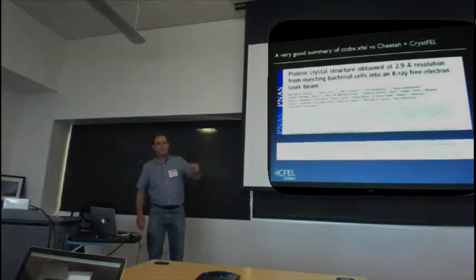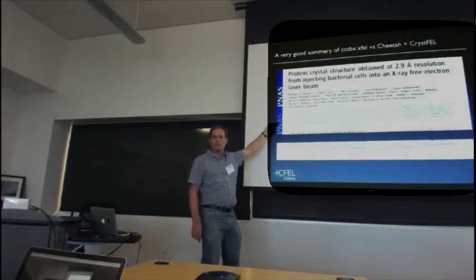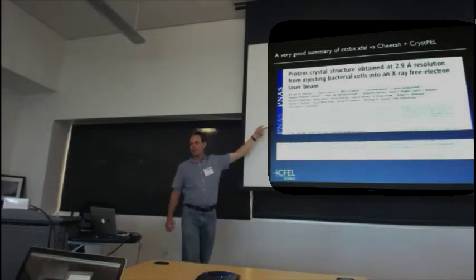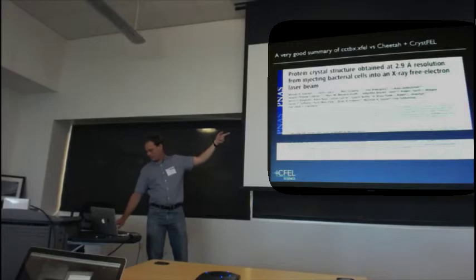On bibliographies, I was pointed to this paper the other day. Tom and Carol pointed it in my direction. It contains a really nice discussion of CCTBX versus CrystFEL. Actually, I read it on the plane, and it's a really nice read. So that should be added to everyone's reading for this meeting, because it's actually got a really, really nice discussion in the back of it, and it's done really nicely.